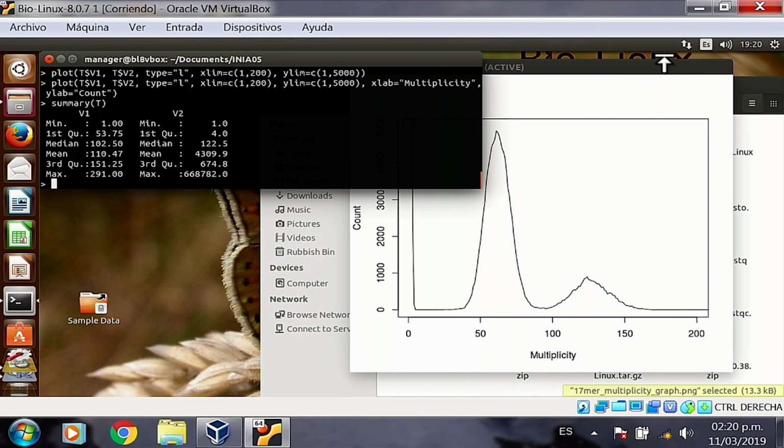If we're already here, this is the most important part of the interpretation. What does this mean? What does this graph actually tell us? It's very nice to plot it, yes, but we need to get some information from that. What does this mean? Any guess is good at this point. Does anybody want to guess? What does this graph mean?